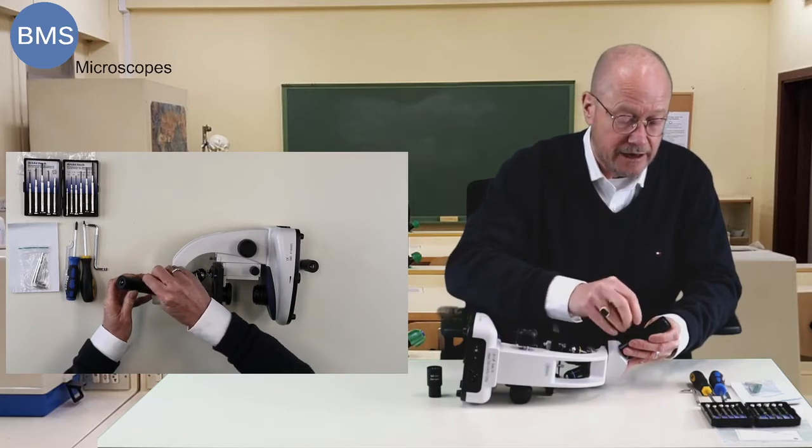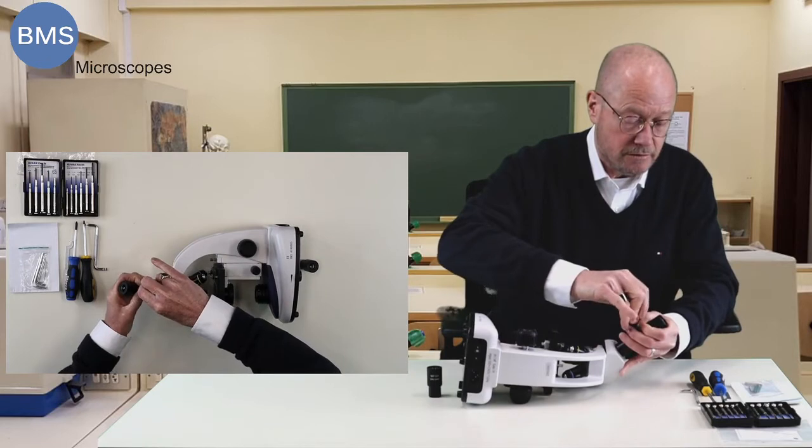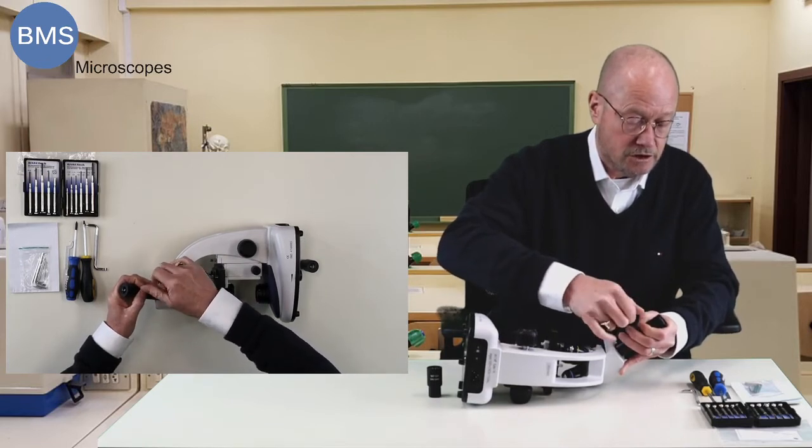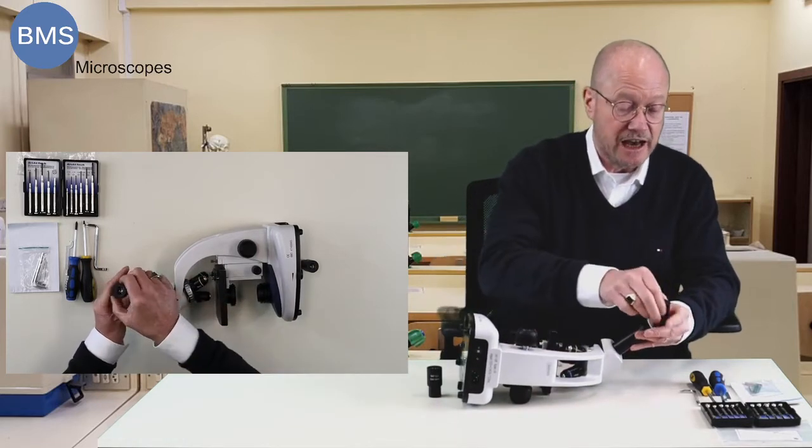Place the Allen key. Unscrew it just a little bit so the eyepiece comes out of the tube.